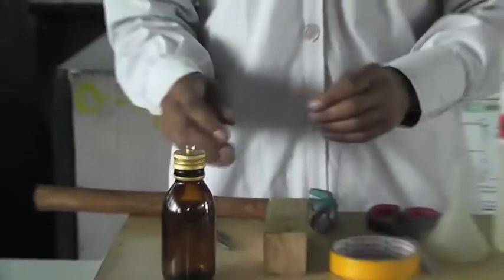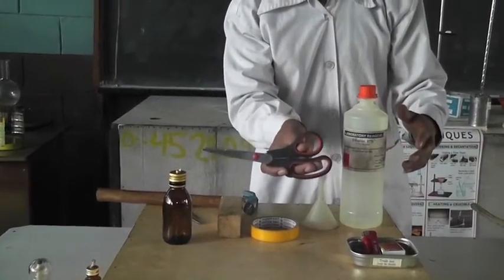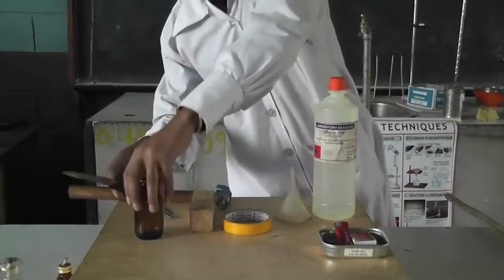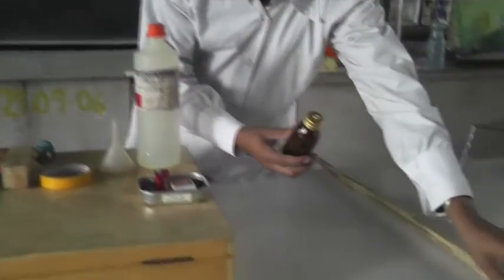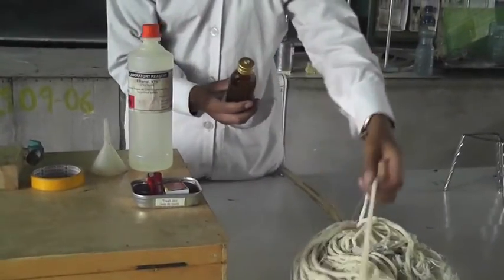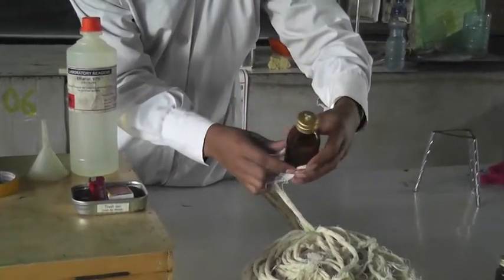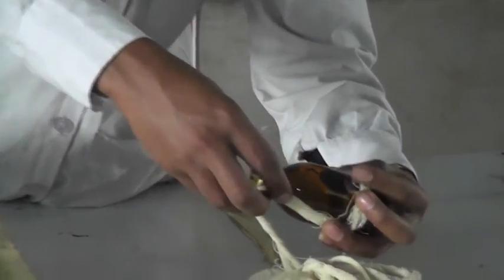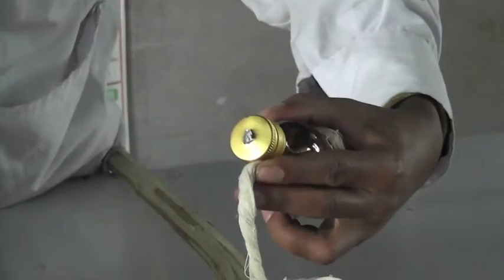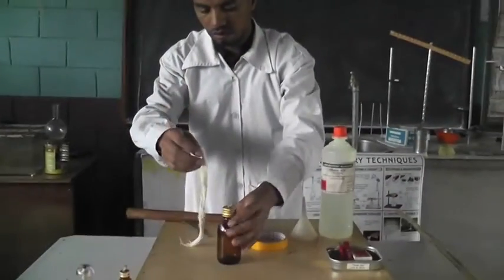Now we put the rope through and cut it. We cut the rope using the scissor. First, we have to measure how much rope is needed. We can get the cotton rope from this material. To measure for this glass, this much amount is okay. So we measure and cut — we have this much.